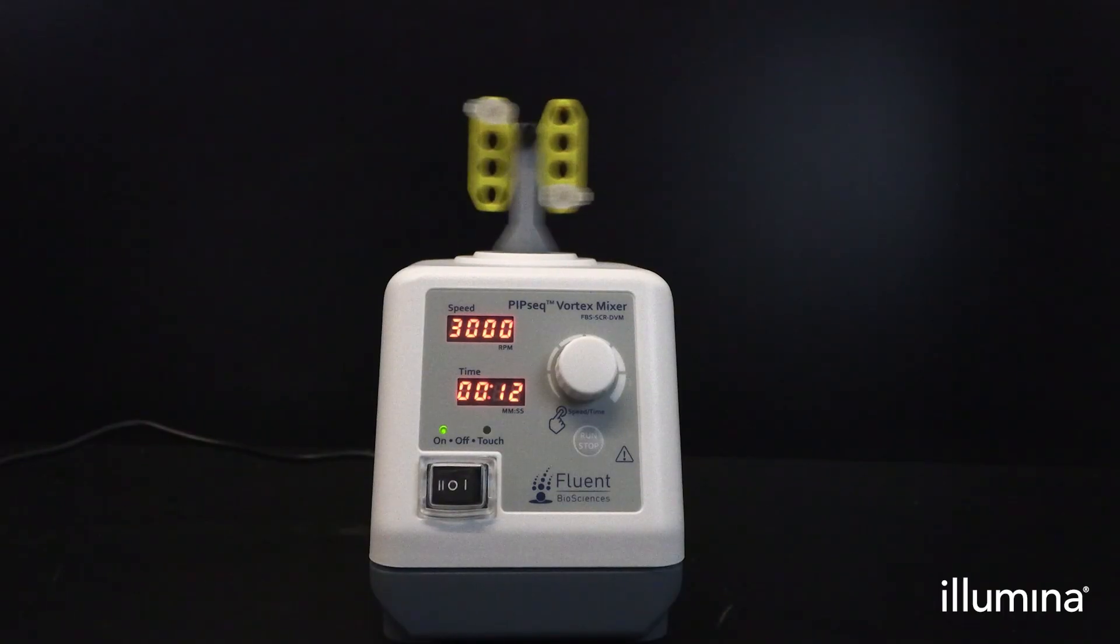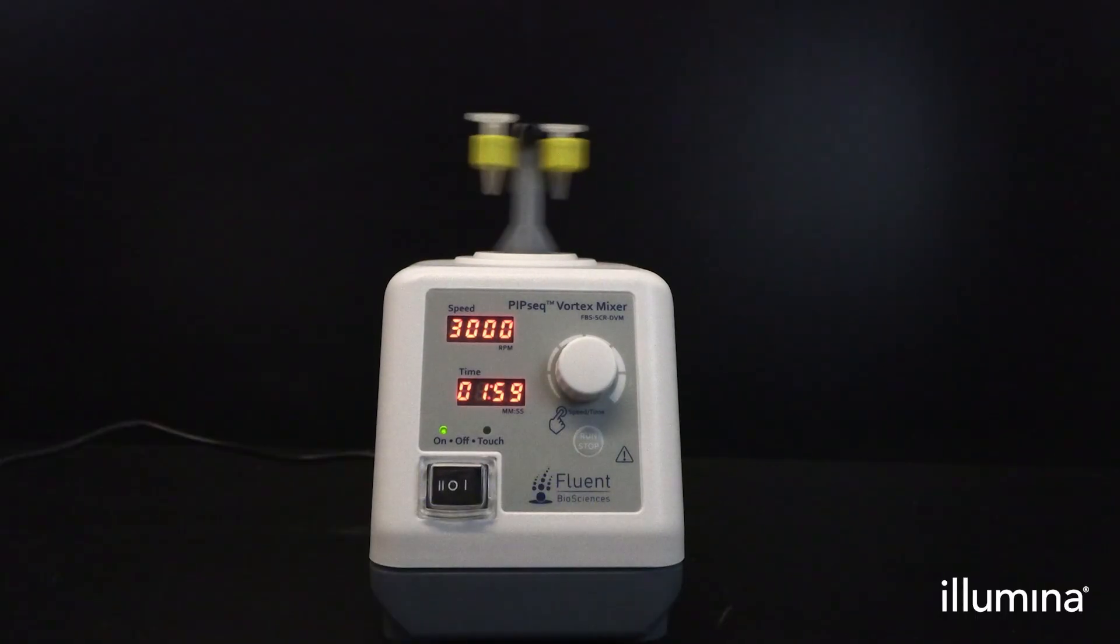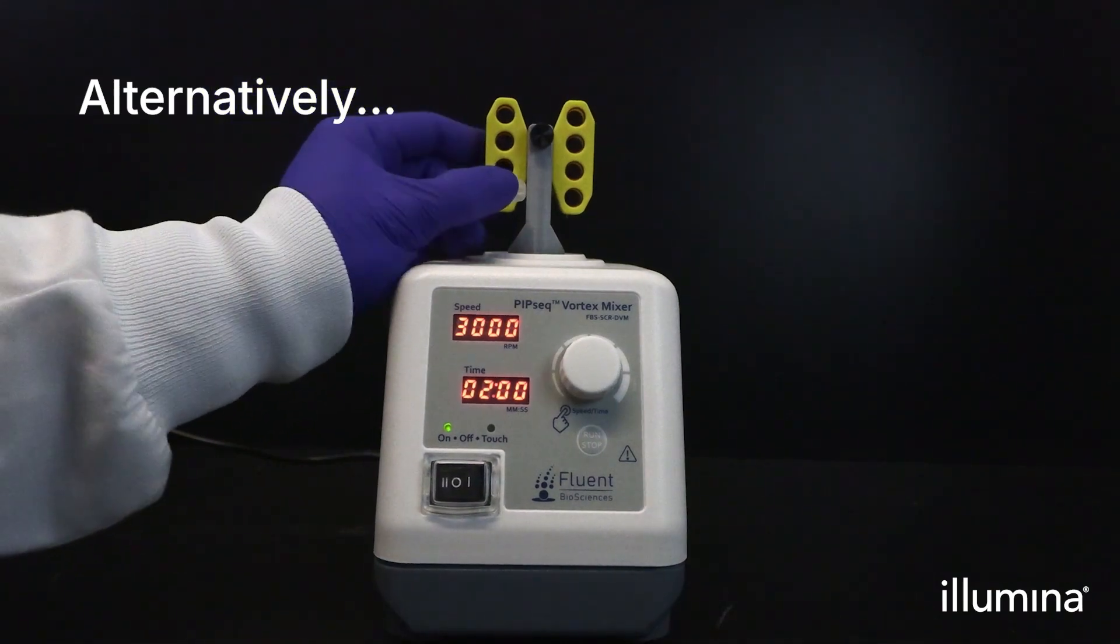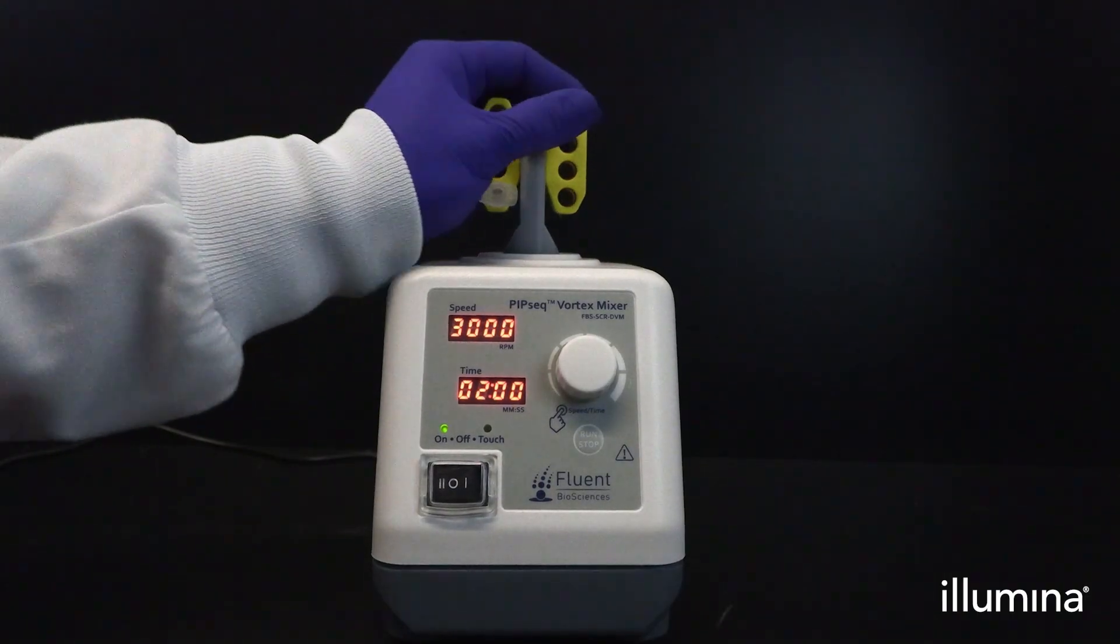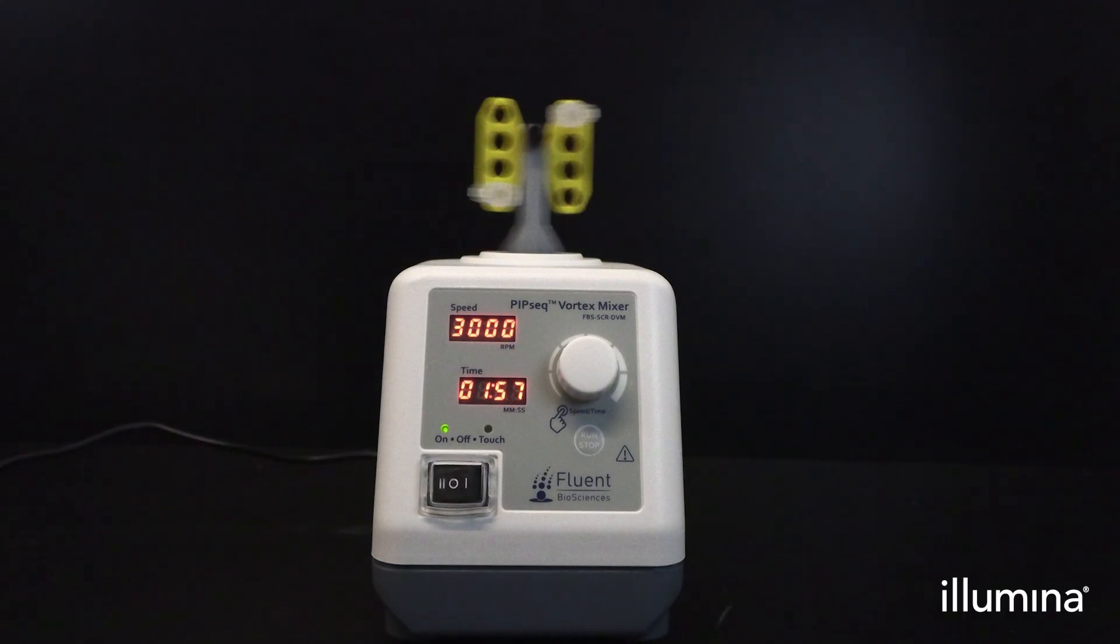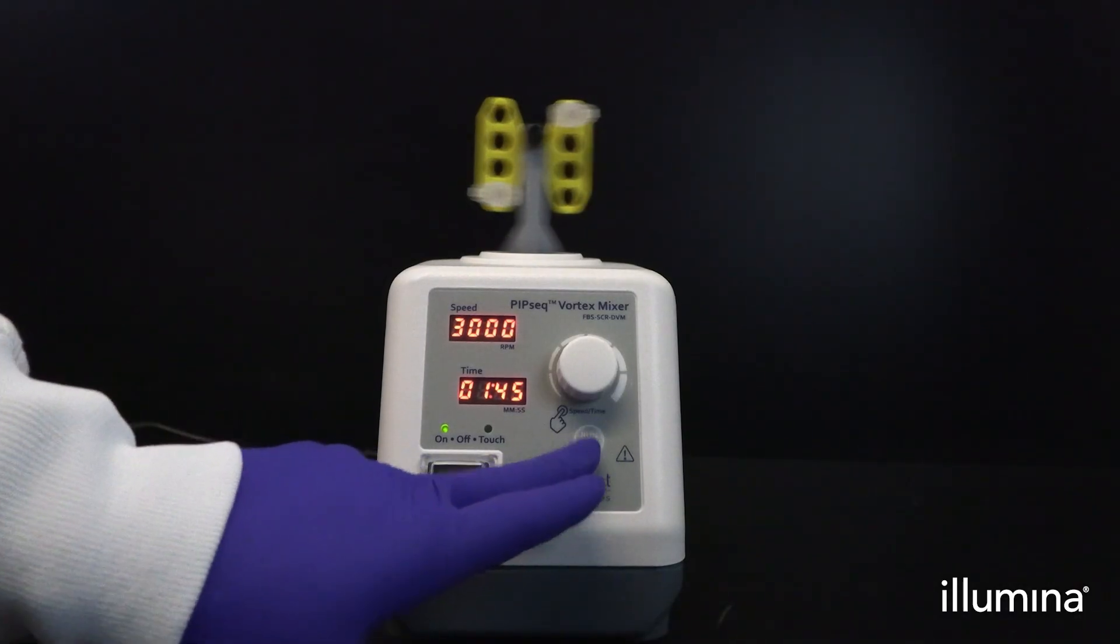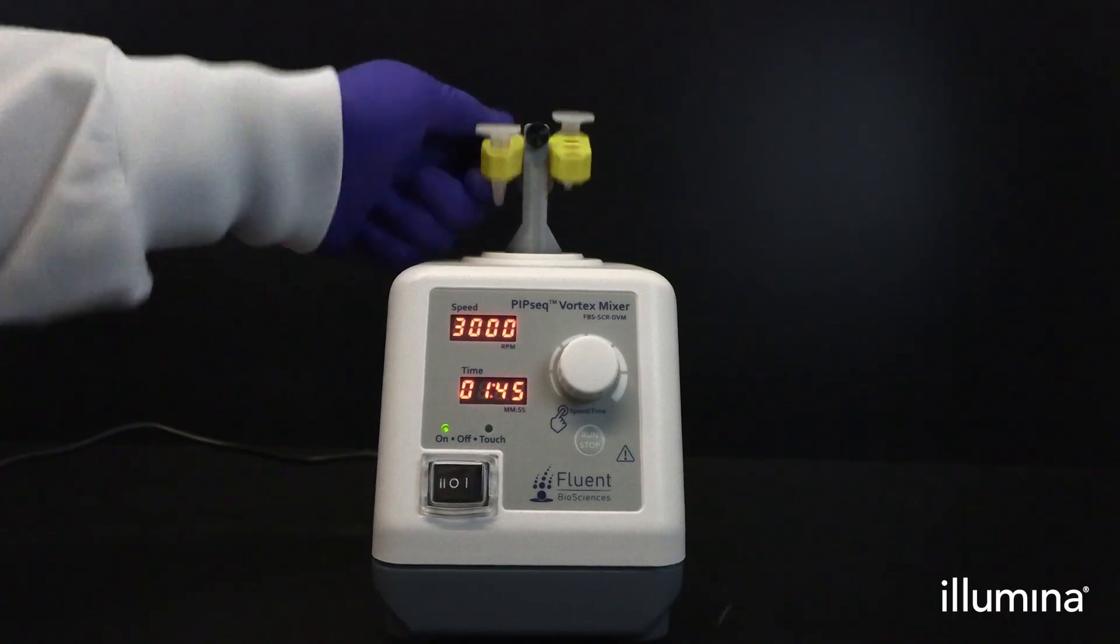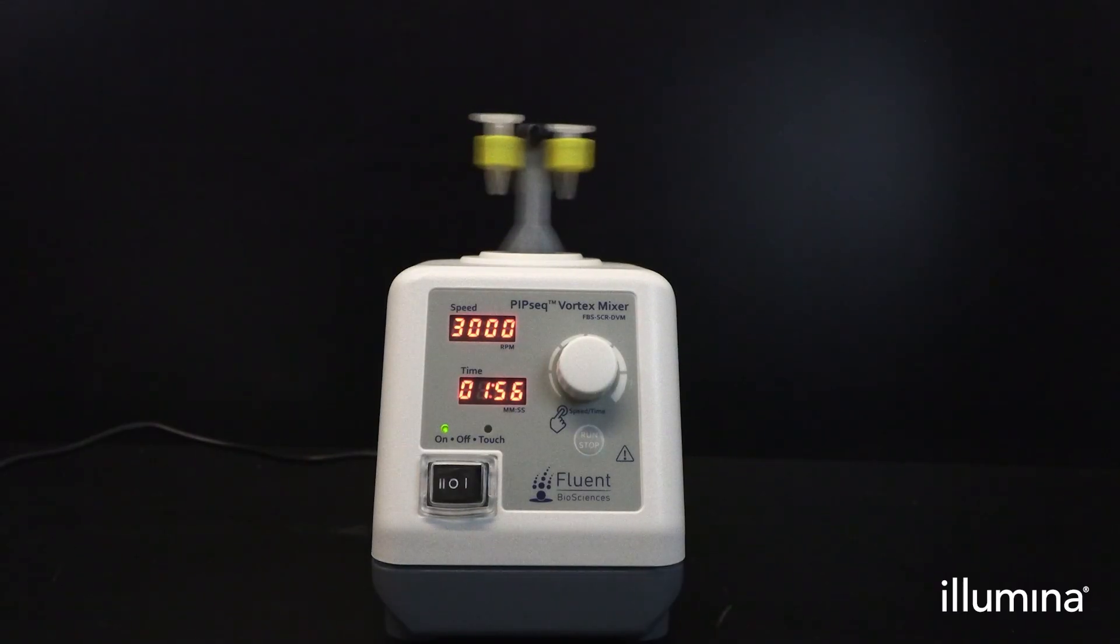Samples will be vortexed for 15 seconds in the horizontal configuration, followed by 2 minutes in the vertical configuration at 3000 RPM. For better vortexing efficiency, we recommend starting the timer at 2 minutes and stopping the vortex with 1 minute and 45 seconds remaining, or after 15 seconds of vortexing horizontally.